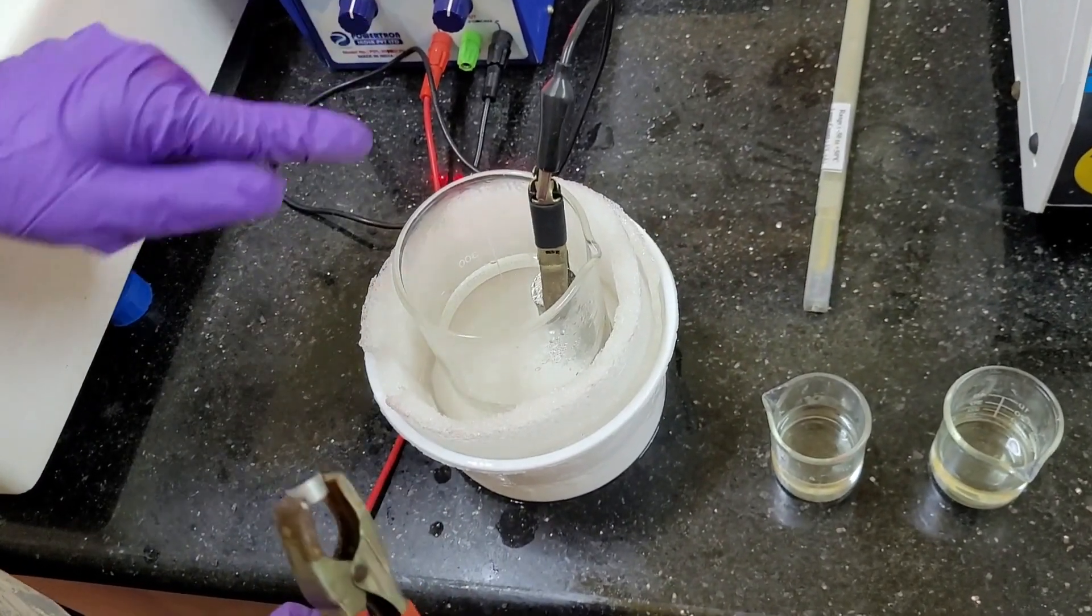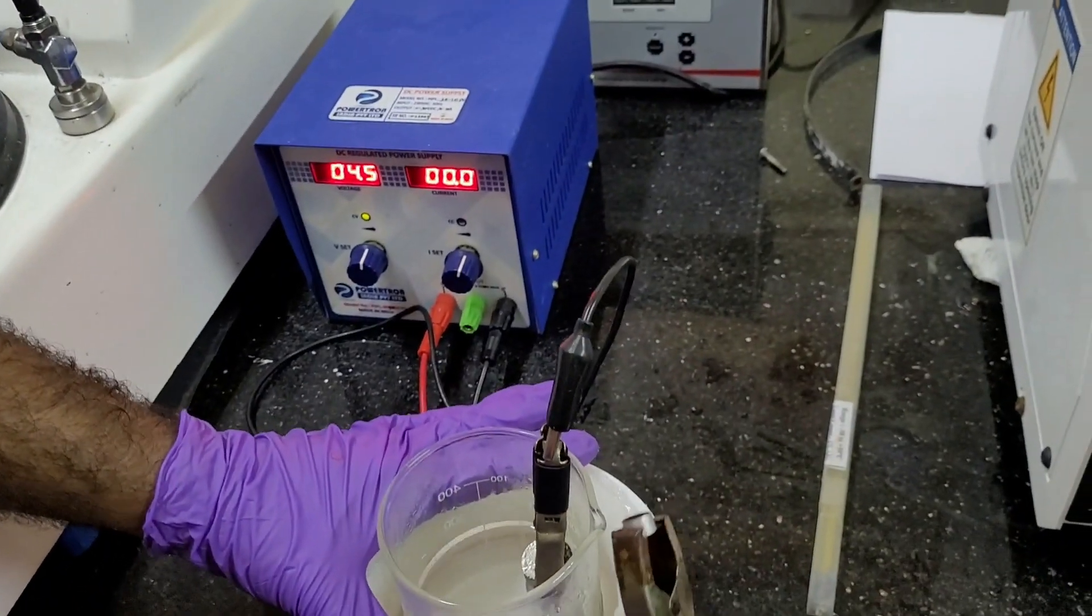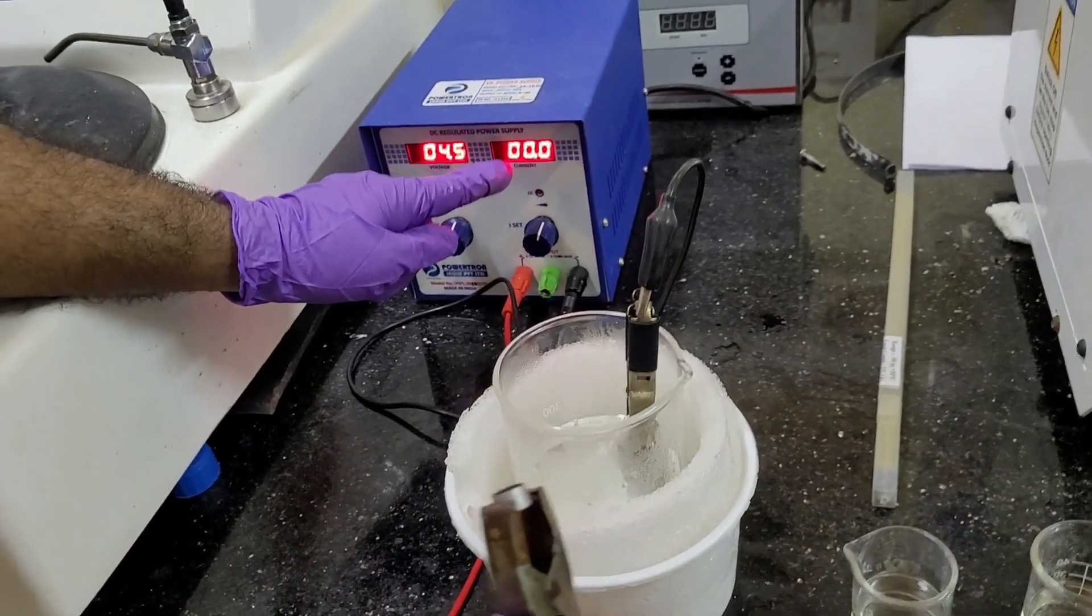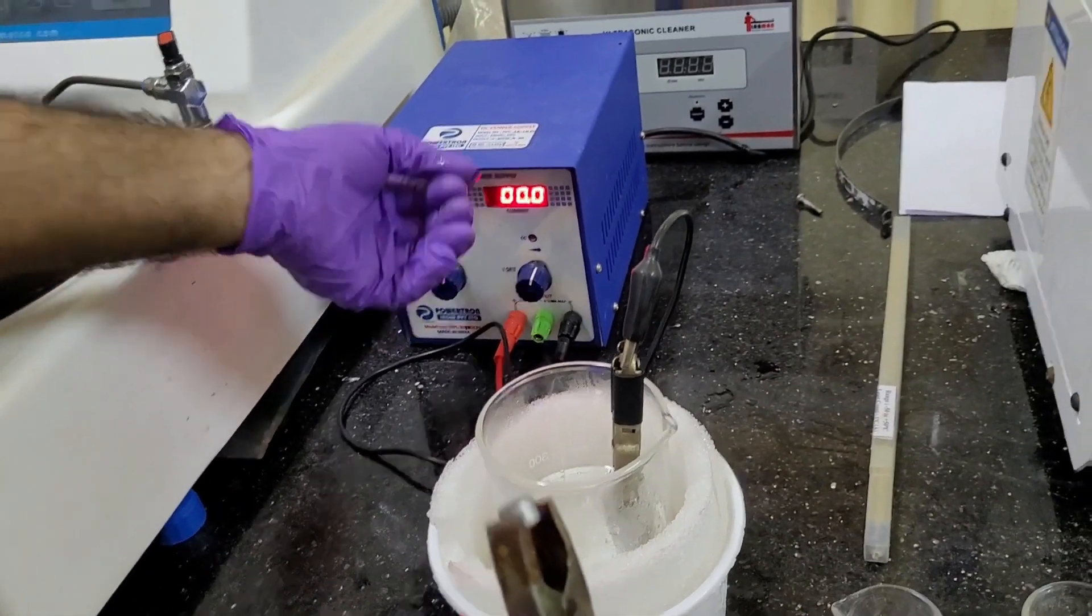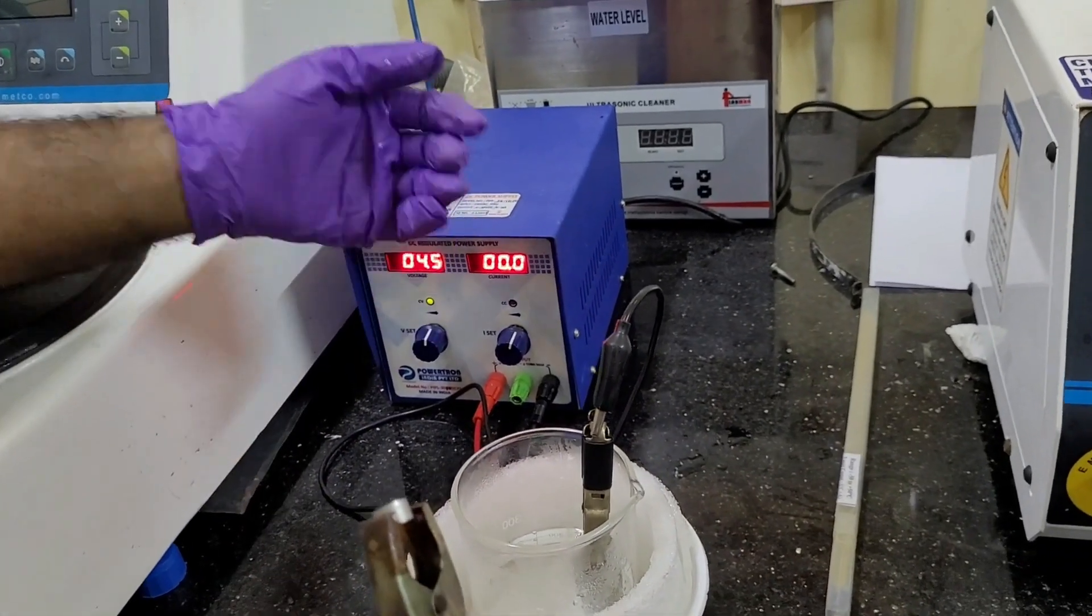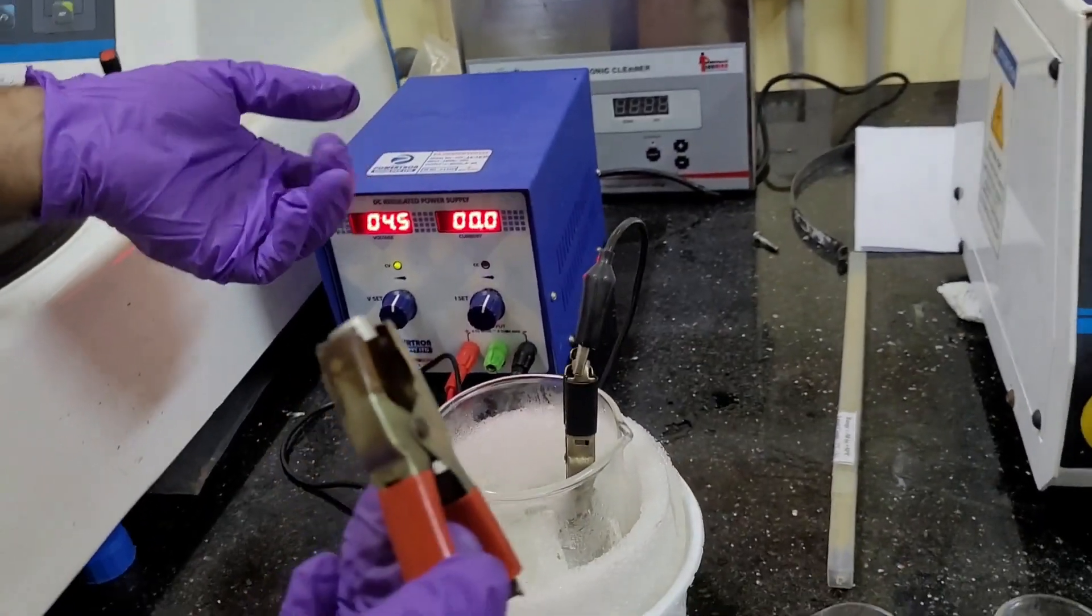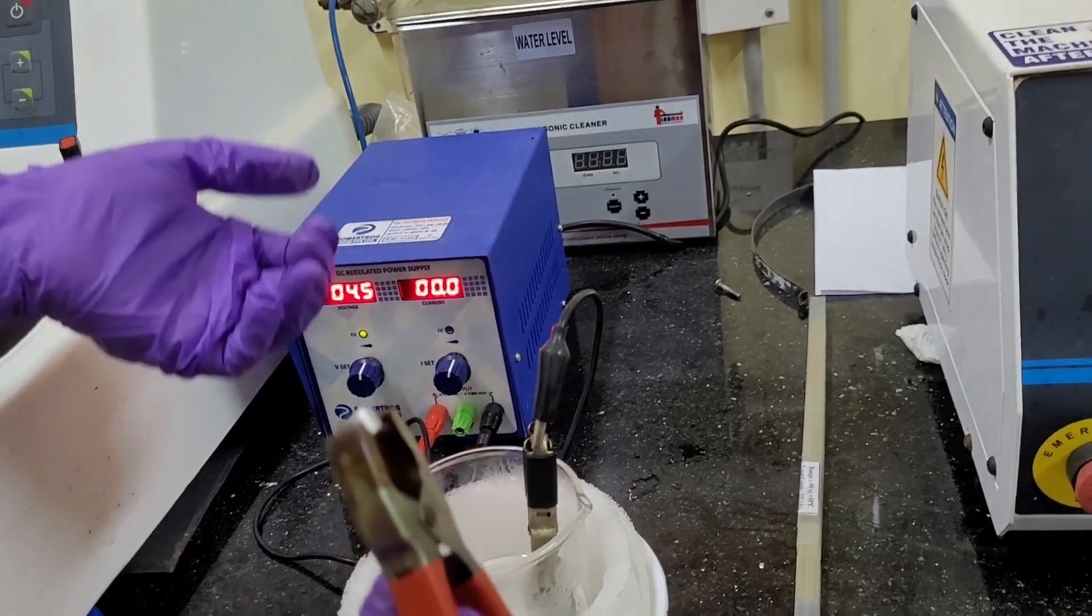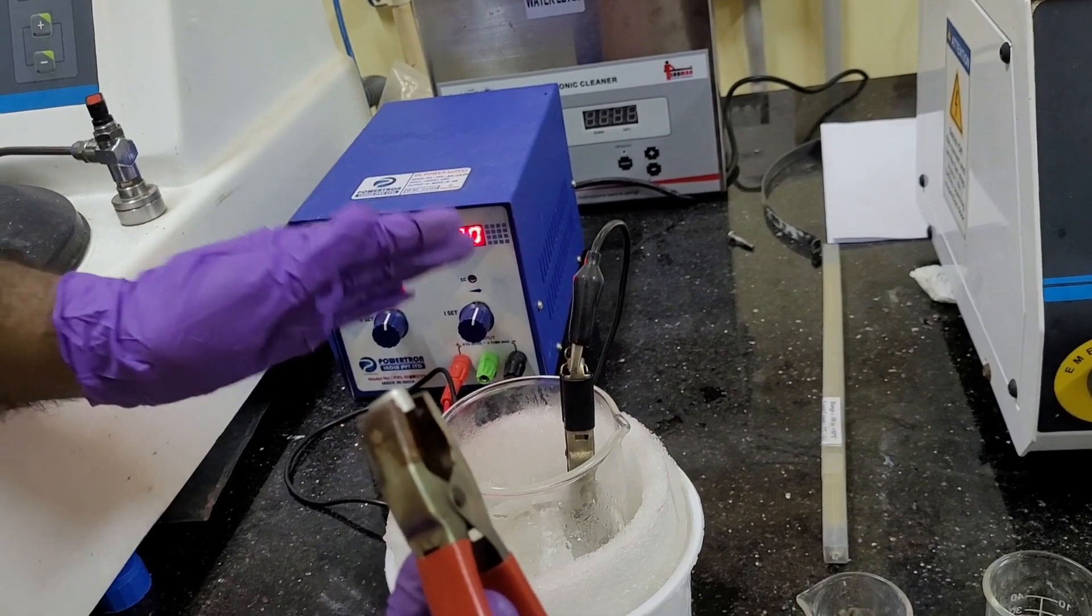So, the main important point is, when we are doing the electropolishing, we have to keep in mind that how much current is appearing. So, if current is appearing more than our targeted, targeted current or less than targeted current, so, we have to immediately stop the electropolishing.